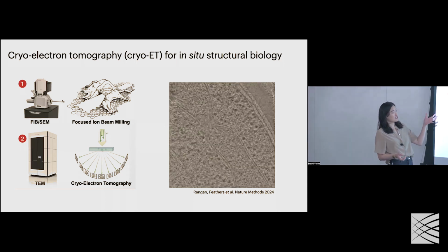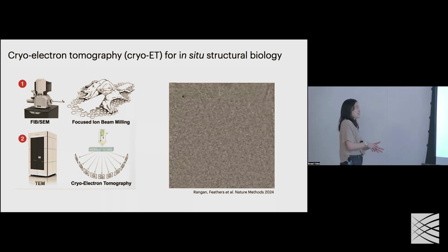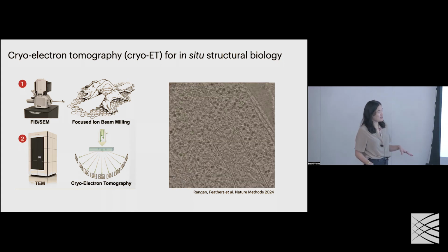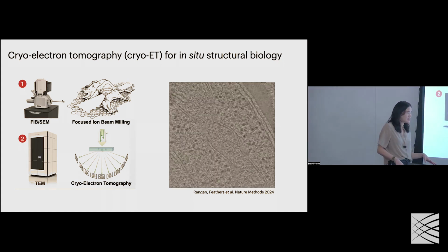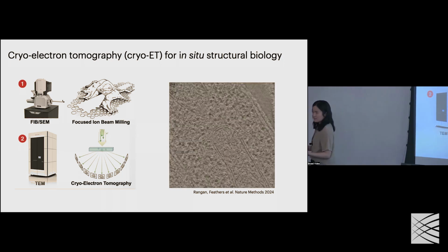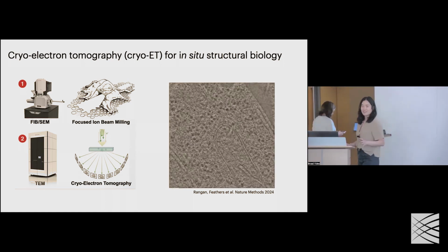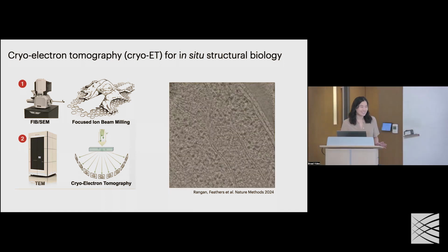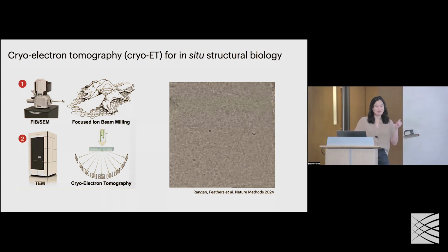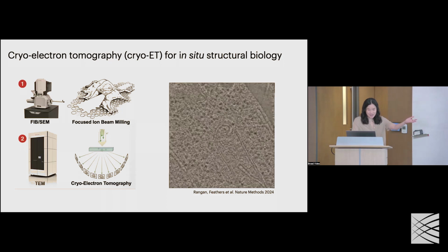If it's a large enough cell, you want to high pressure freeze it so it all vitrifies at the same time. This is beyond my area of expertise, but I think a plasma focused ion beam mill is less likely to deposit a bunch of other stuff than a metal ion beam mill. So Thermo Fisher is working on it and interested in people buying their stuff.